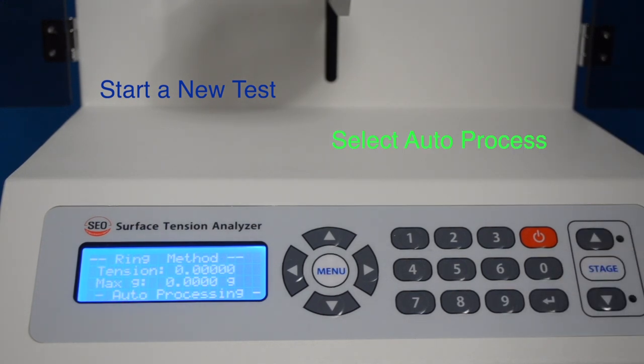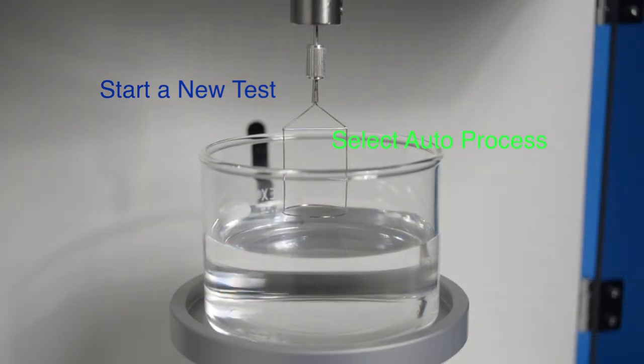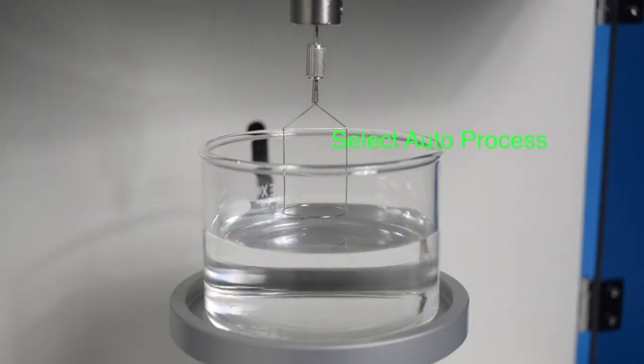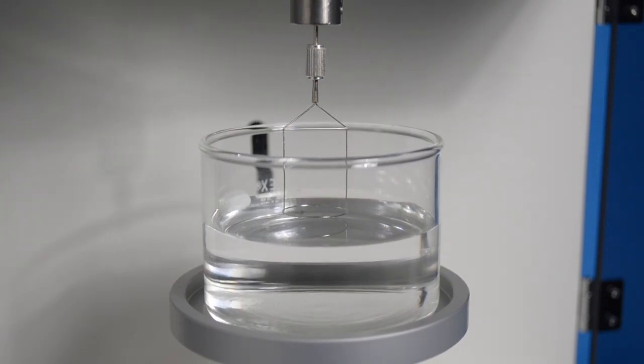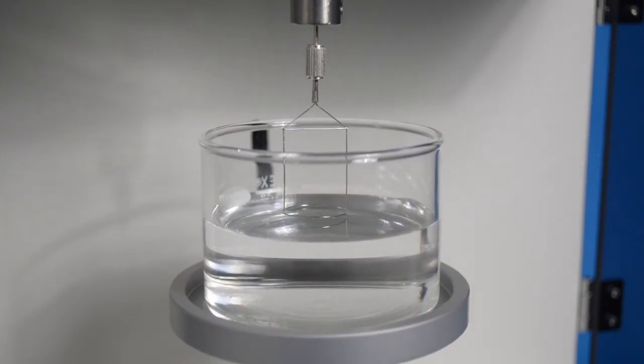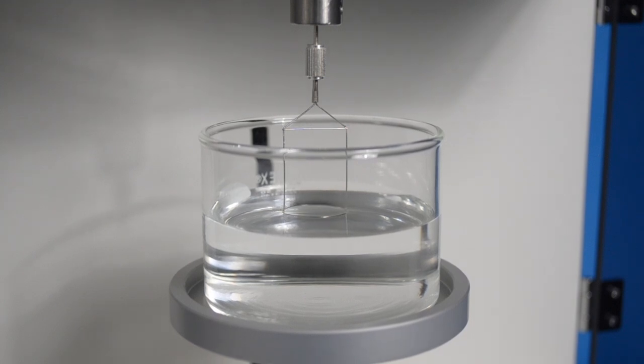To start a new test on the same type of product or the same product, all you do is select autoprocess and immediately the stage starts to move up on the ring.